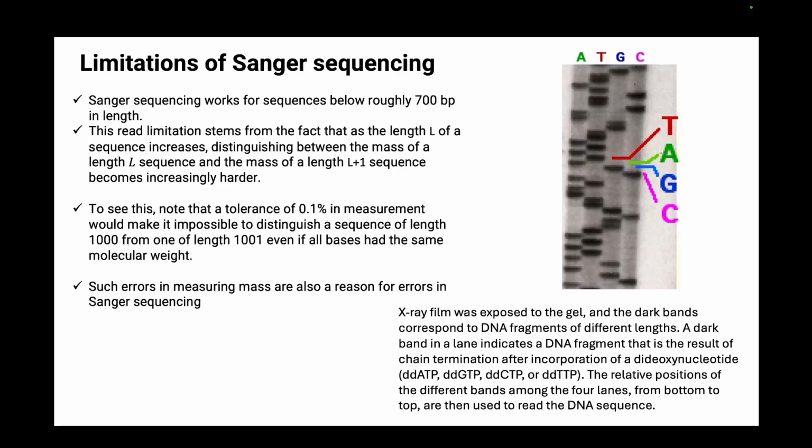So ultimately, you're basing your logic in the fact that you need to distinguish these small fragments of DNA based on their mass, but it is not always possible because, as I said, as the length increases, it becomes more difficult to resolve the two different sequences of DNA. But during this distinguishing, you are ultimately measuring the mass and comparing across different strands.